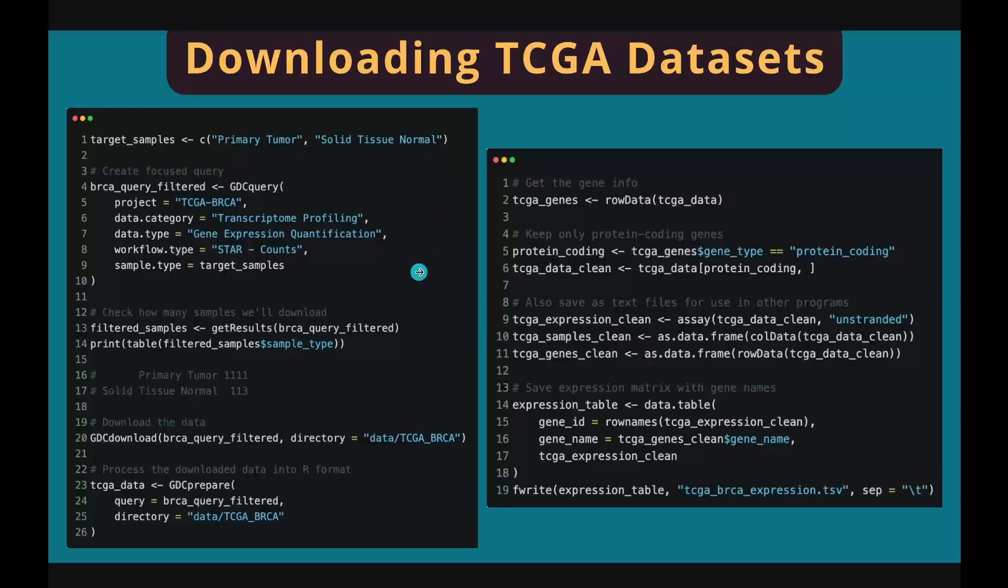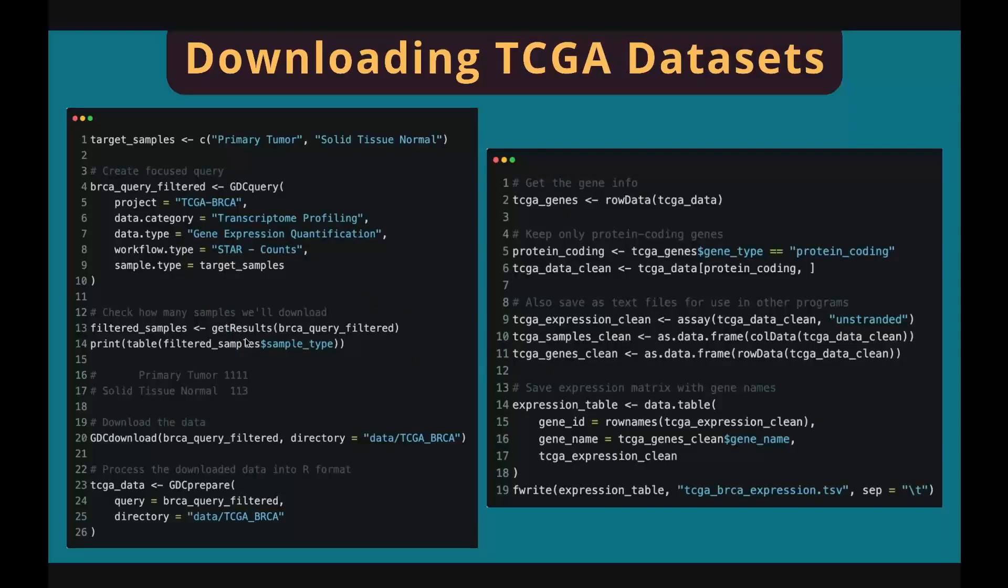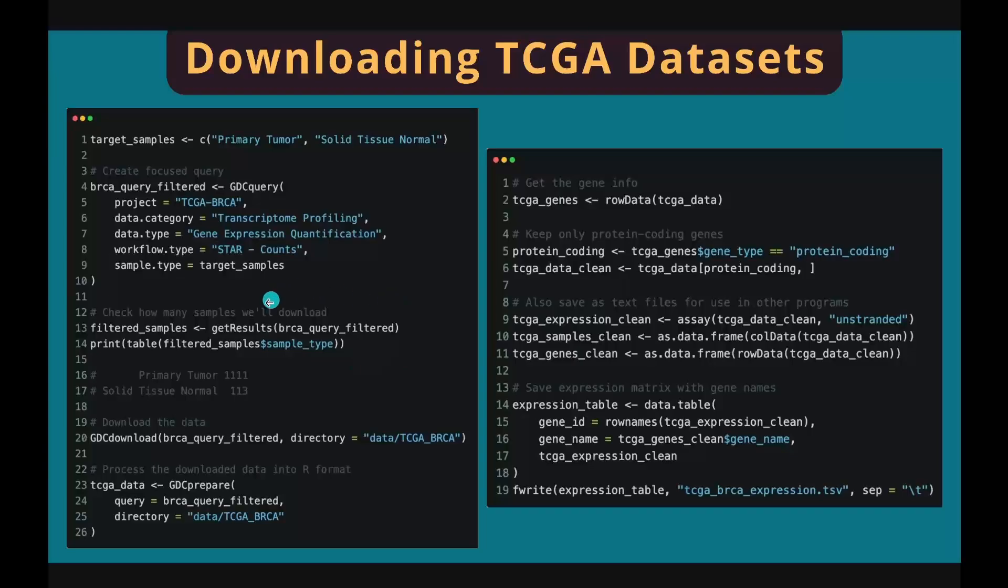If you don't know what kind of sample types are there in the dataset, you don't have to specify it because the following code will tell you what's inside. The getResults function retrieves the meta information of this dataset. In the return meta table, the sample type column contains the information of the tissue type. In this case, we have primary tumor and solid tissue normal.